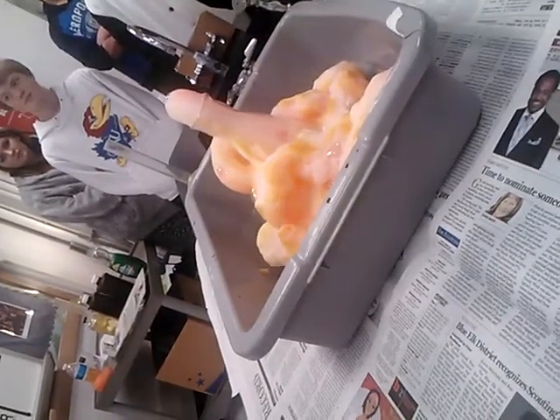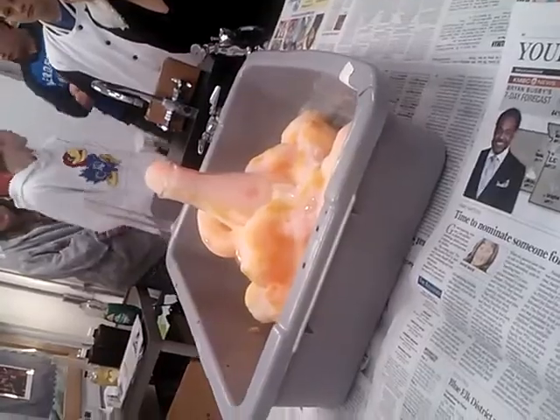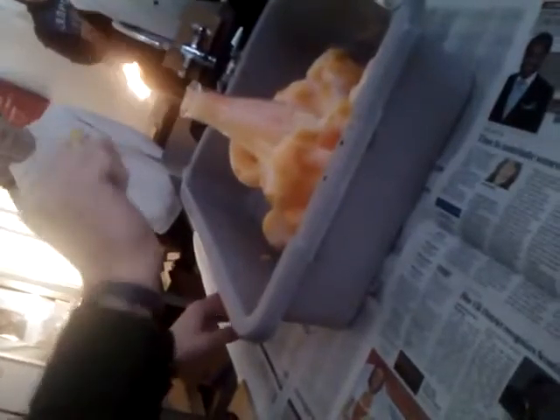So we should be able to test that fact. Jacob, will you turn the light off, please? We get some burning. In fact, we should see if this reignites. And it does. Because it's a pure oxygen environment, the wood splint will reignite.